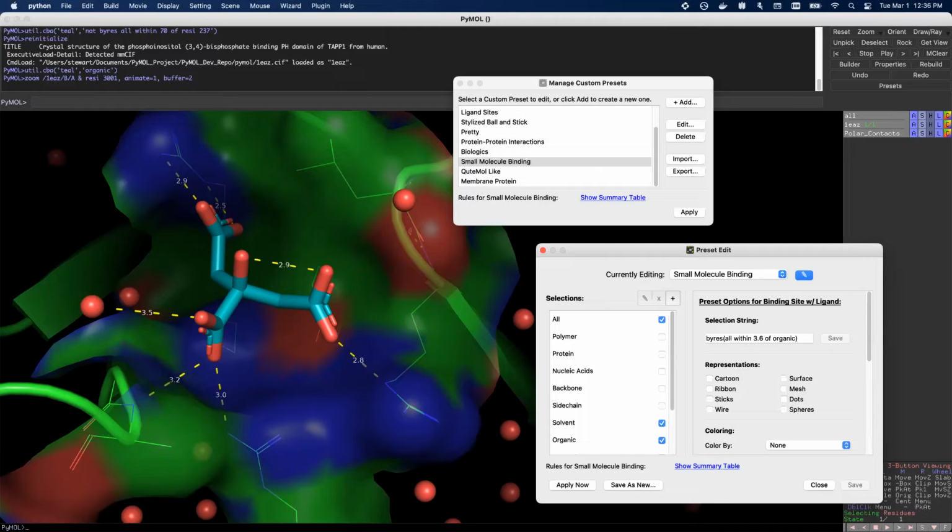Yeah, and I think there's always that moment in a biochemistry student's journey where they start realizing that structure is less defined than it's implied initially, if that makes sense. Like this little loop region that you see looping out very far from the protein, that's probably not actually indicative of what its normal state is, or it's constantly going to be in flux. But that gets into there's limits to how much a tool can solve that. I think it's just PyMOL is used so much for education that it's going to be something coming up.